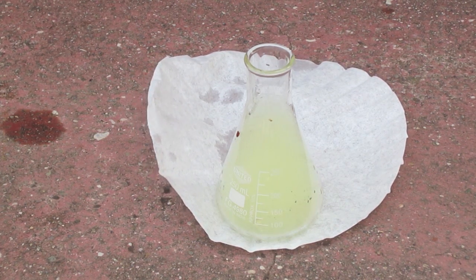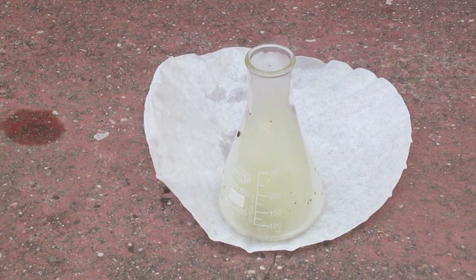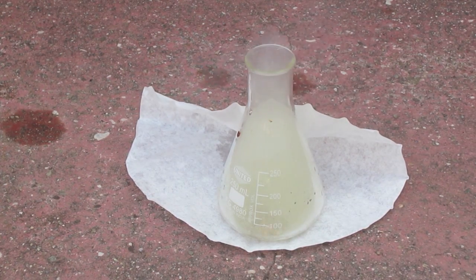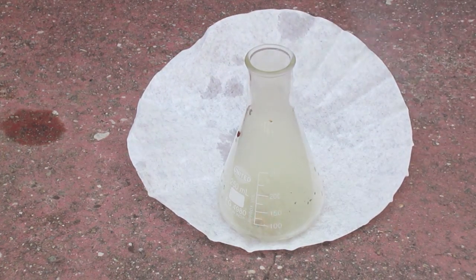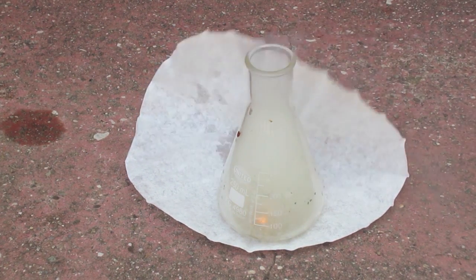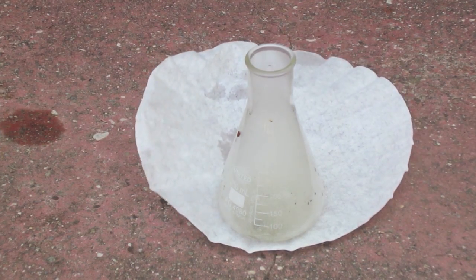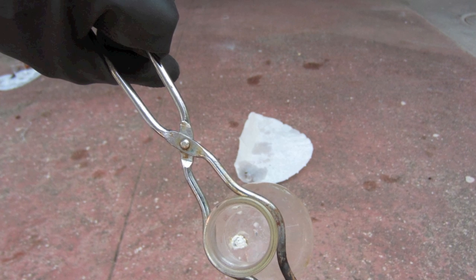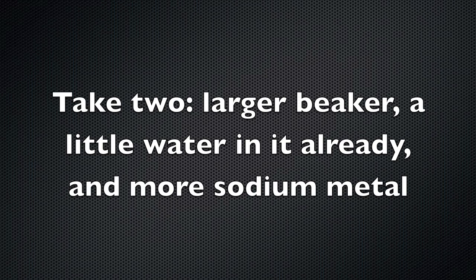You can see I'm really excited about it happening. The reaction starts picking up, and I've been wanting to do this reaction for a long time. You can see some smoke in there, which is actually particulate table salt — particulate sodium chloride. Then you'll hear a little sound — that's glass breaking. And there's the product: some salt with the broken glass. There's the table salt.